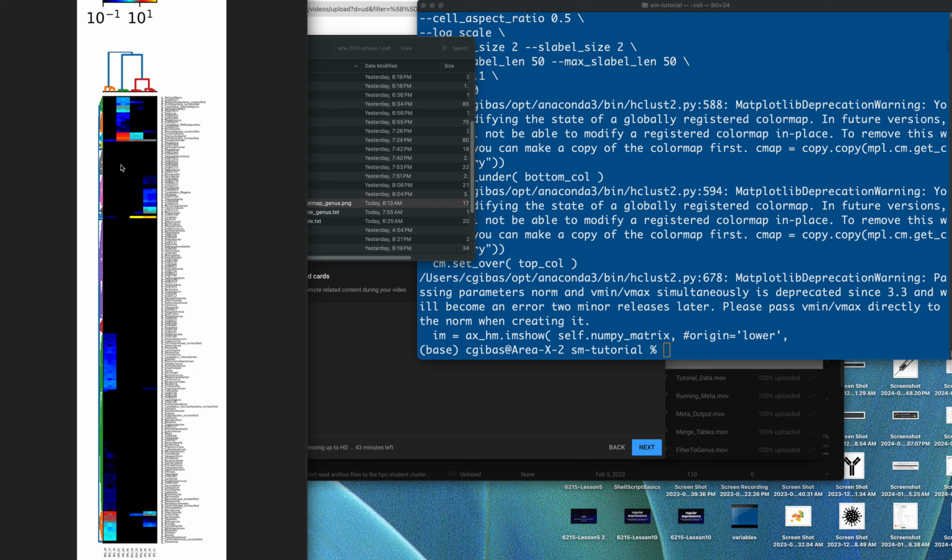You could sub-select this data based on what you see here and choose not to display rows where you have almost nothing present, because that complicates the visualization of your heat map.